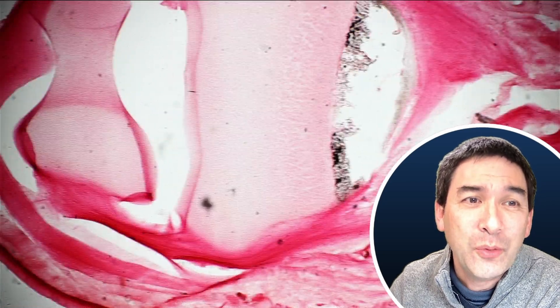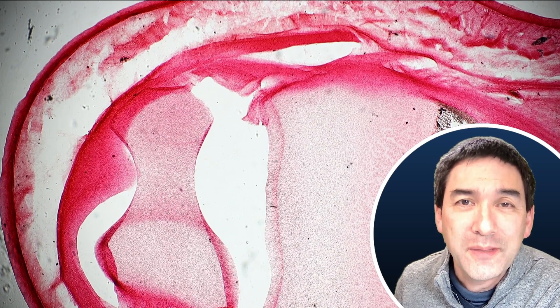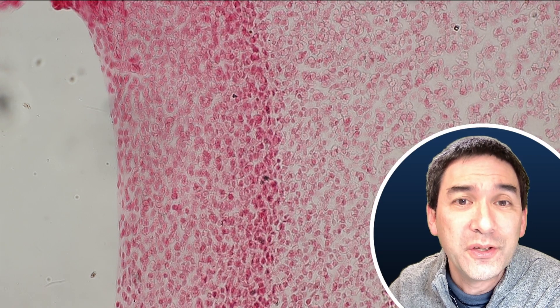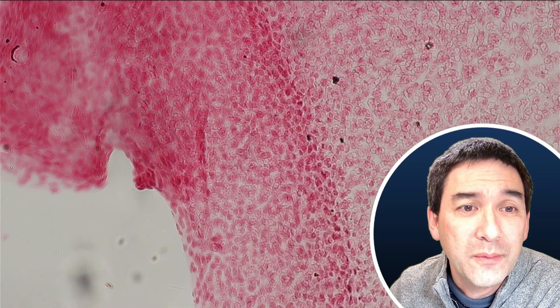A four-month-old fetus is not fully developed yet, so some structures are also not fully developed. I'm going to start here — this is the region of the fingernail, and I was able to see individual cells. I'm going to go up with the magnification. This is now using my 40x objective, and this is one of the few parts in the specimen where it is possible to see individual cells; on other parts, the cells are clumped together quite a bit. I don't know if this is the region where the fingernail is going to start to form, but the tissue of a fetus is not fully developed yet, so everything is still very soft — so maybe this is actually the region where the fingernail is going to form.